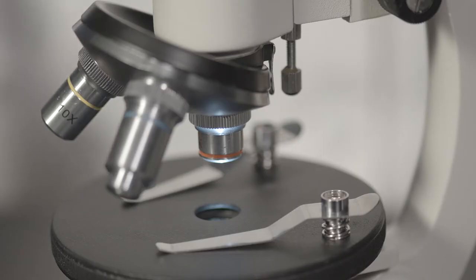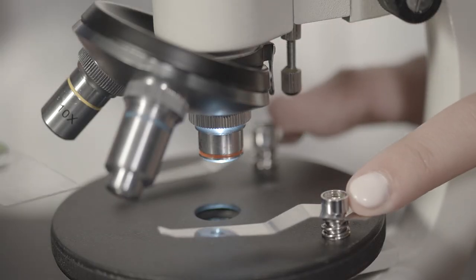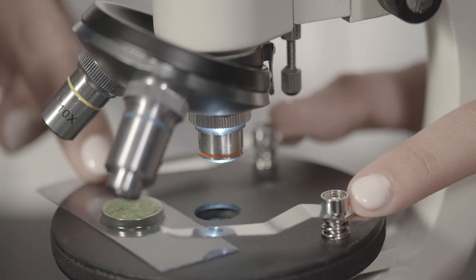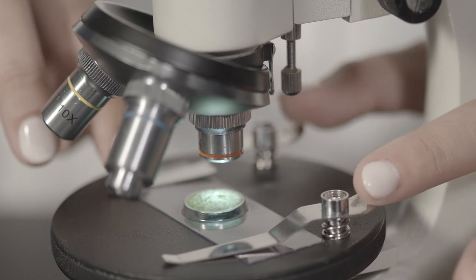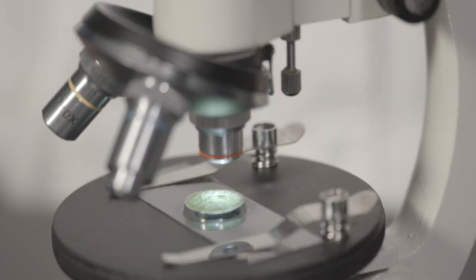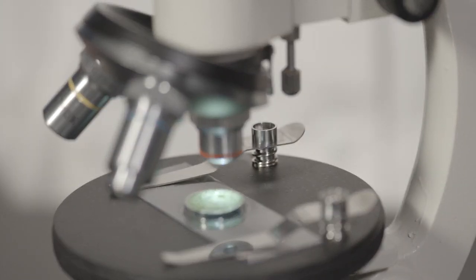Another advantage of the cordless microscopes is that they use an LED lighting system instead of the traditional tungsten. This type of lighting system produces virtually no heat, which is very beneficial when viewing living protozoans.